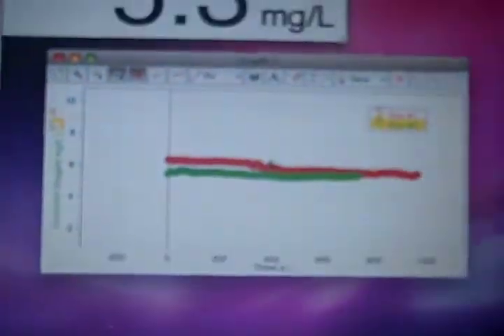So we predicted that with the light turned on, there'll be less oxygen in the container because of the water evaporating, and there'd be a lot more oxygen without the light because of the plant taking in the oxygen from the water and creating more. As a result, we got that the oxygen went down both with the light on and off. With the light on, the oxygen went down a lot faster than with the light off, and you can see on our graph that this is true.